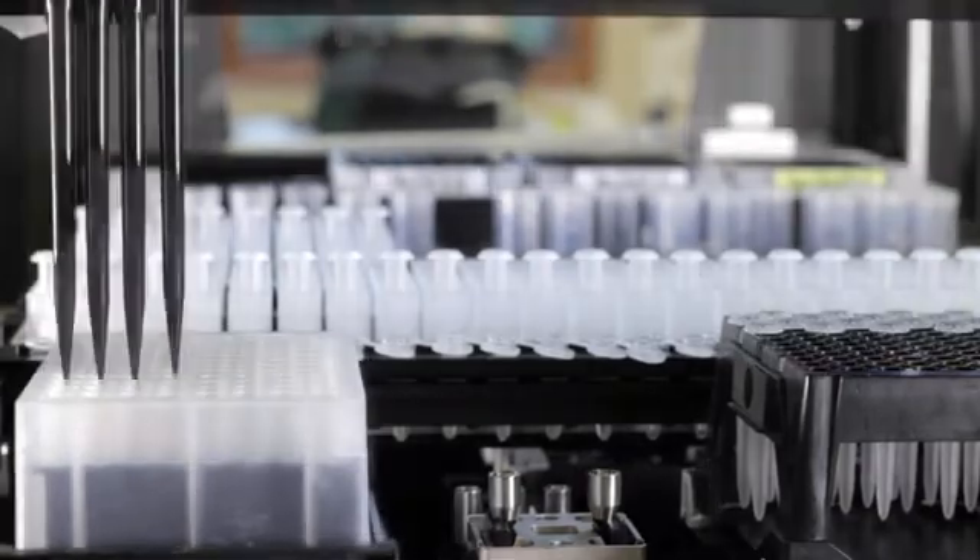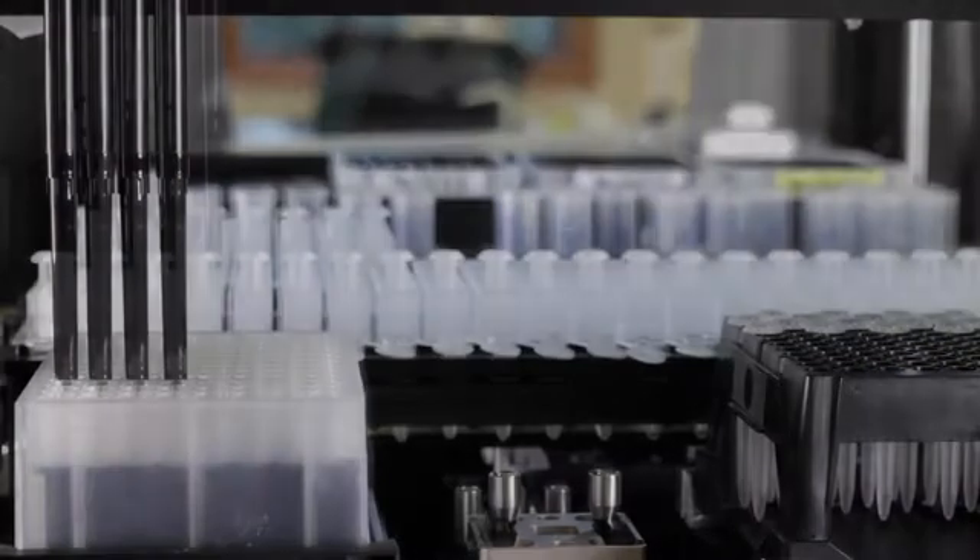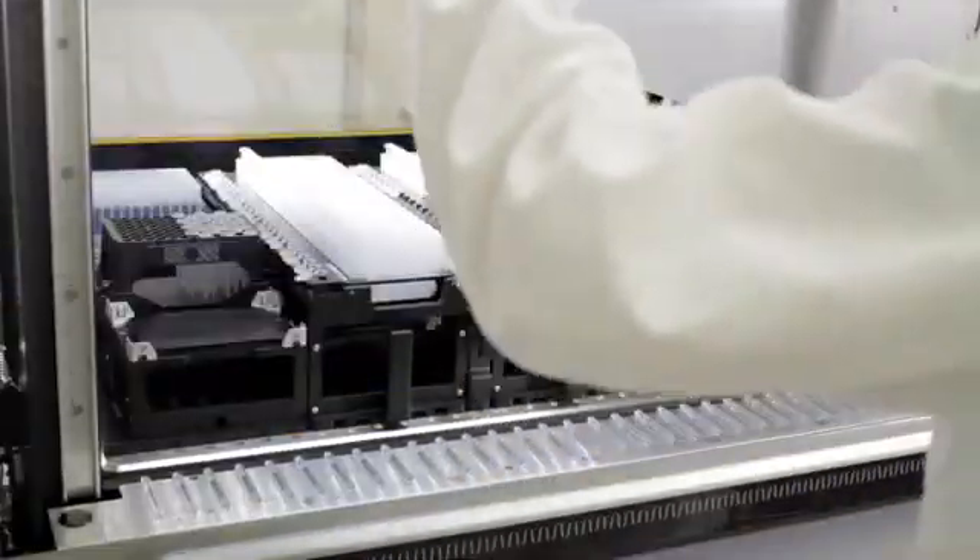Once incubation is complete, the samples are transferred directly to the Maxwell cartridges and the trays are ready for transfer to the Maxwell RSC or RSC 48 instrument.